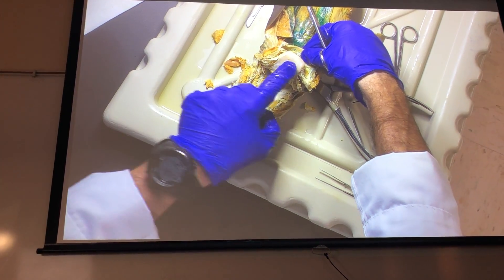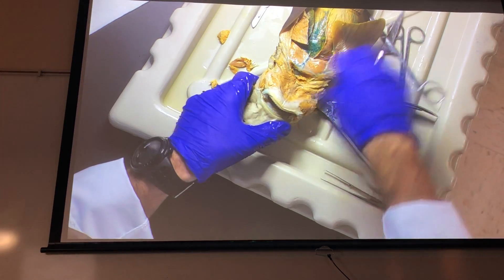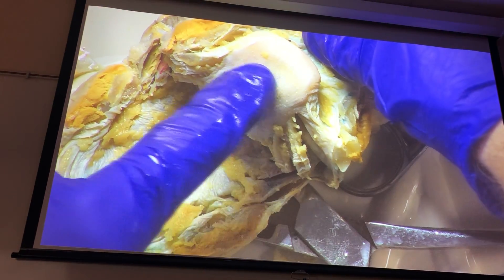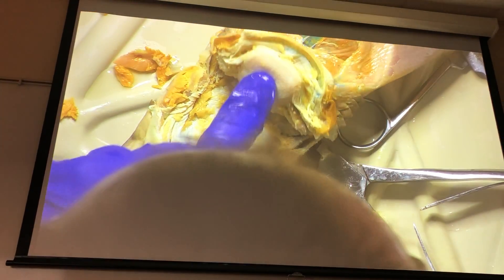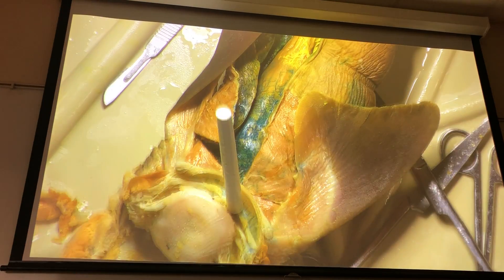You can see the primary tongue. Although we're not worried about it because it's not injected, if you look close you'll see going through the tongue the ventral aorta and the branches going off to each gill. A lot of times it's easier if you just go ahead and stab the lower jaw down so you don't have to worry about it flopping back on you while you're dissecting.